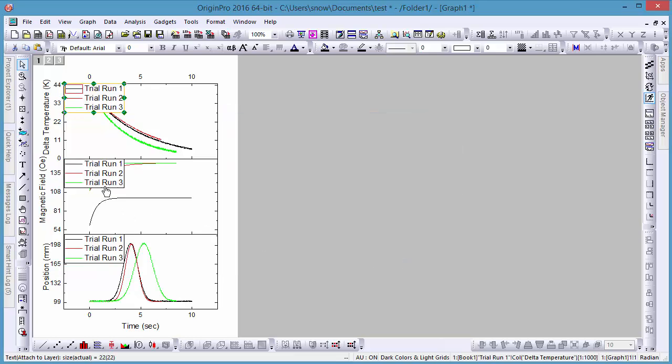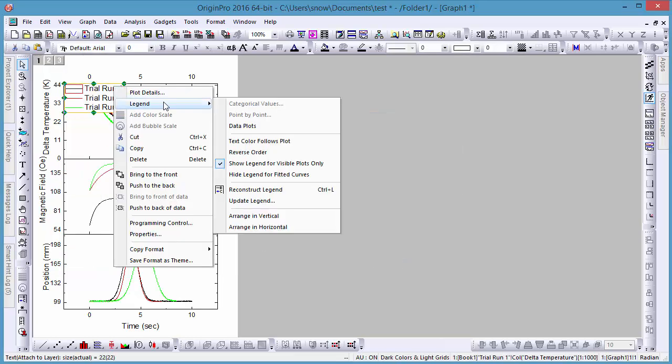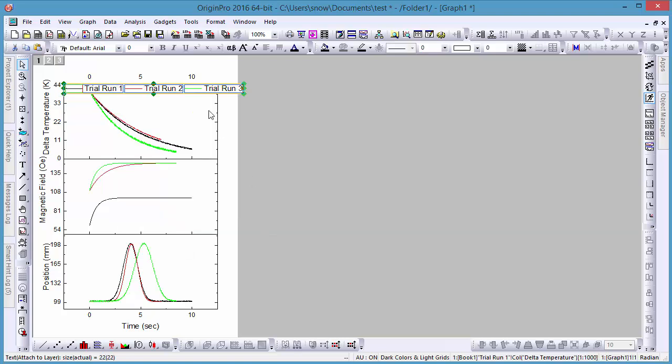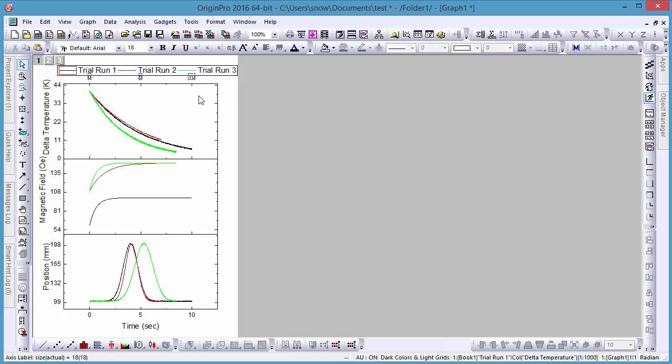Let's remove the two extra legends and adjust the formatting of the one remaining. Here we see our finished multi-panel graph. This is just a brief demonstration of the many uses of the Layer Contents dialog.